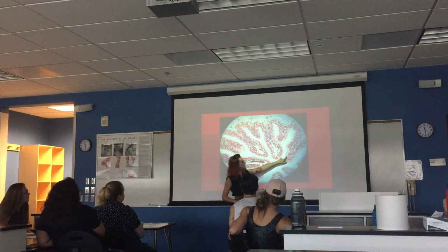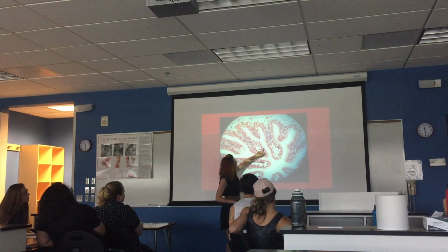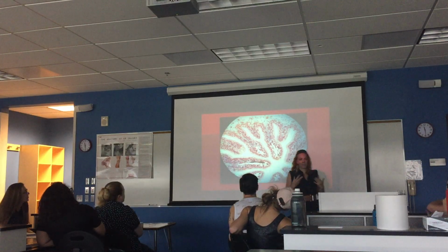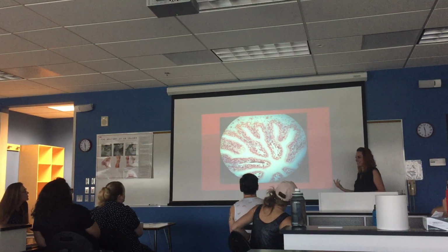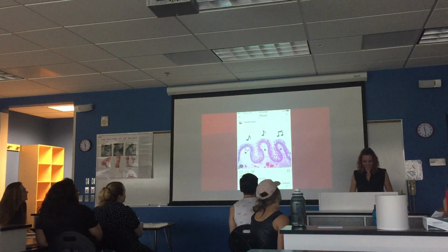We're starting to see these little bubbles in this epithelial tissue, which I'll tell you about in more detail later, but those are going to be called goblet cells. They're a gland that's secreting mucus into the intestine, or gut loop, as I like to think of it.